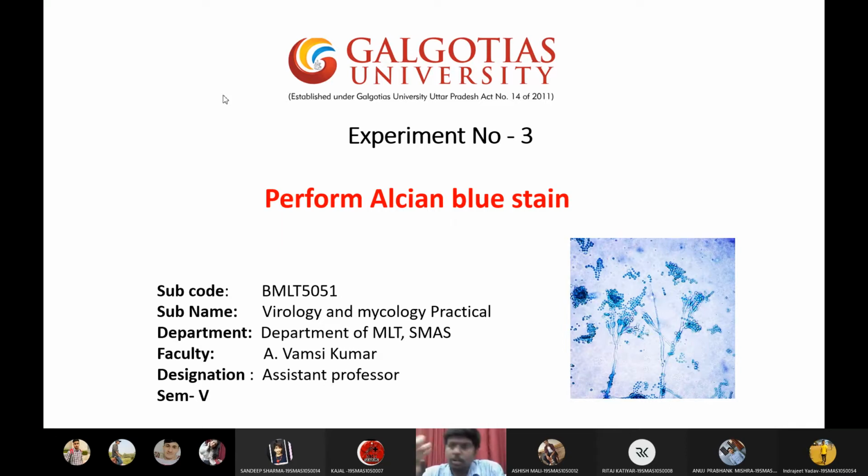Or there is a glycogen storage disease in the liver, where excessive storage of glycogen results in liver damage. Here, I will prepare a stain which will attract to the glycogen part of the cell. If I get color out of this stain, I can conclude that the patient has glycogen storage disease. Such stains are called special stains.